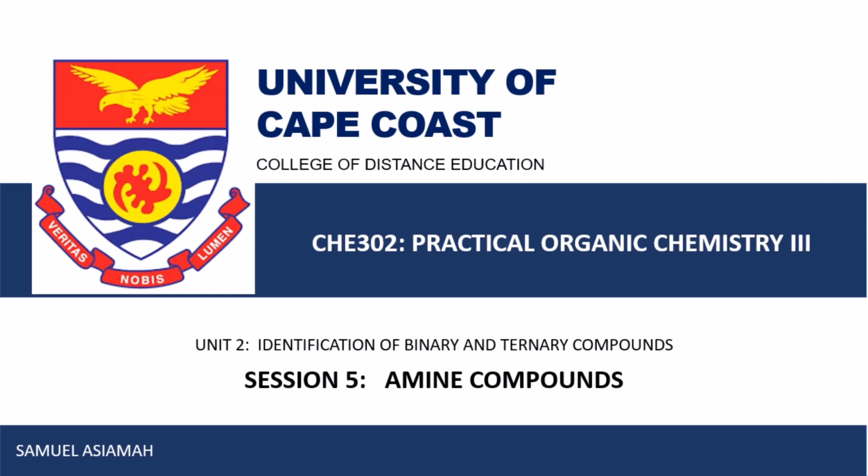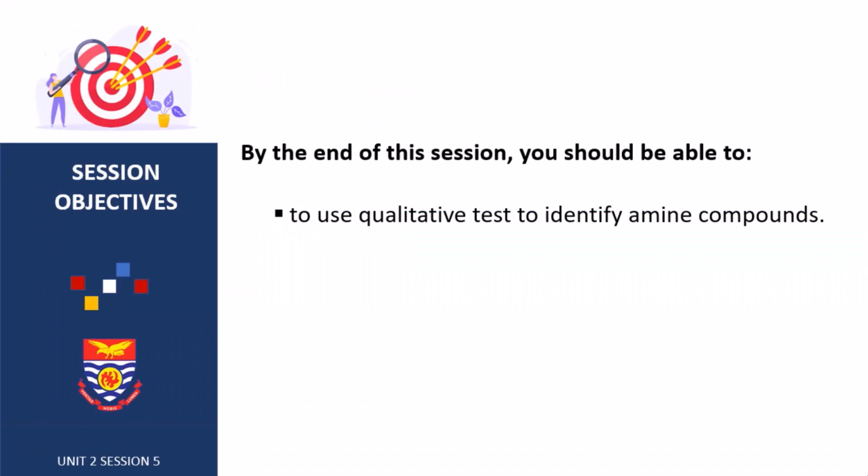Welcome to the fifth session under Unit 2. In this session, we'll be talking about amine compounds. At the end of the session, you should be able to use qualitative tests to identify amine compounds.